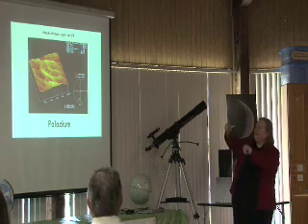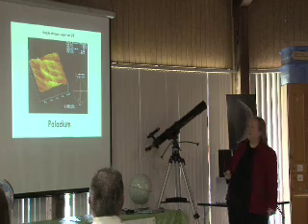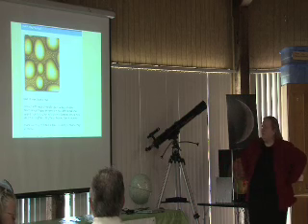It has sort of wavy features, and you see those steps. It looks like water waves or something like that. Ripples, sort of ripples on the surface. So another, just a pretty surface. And what surface does that one look like?